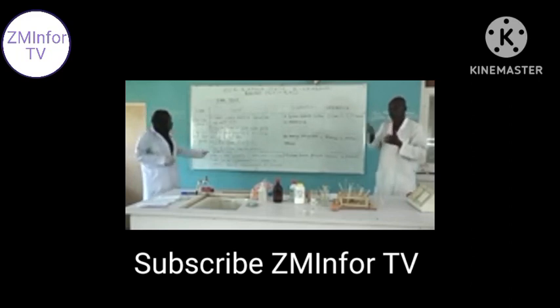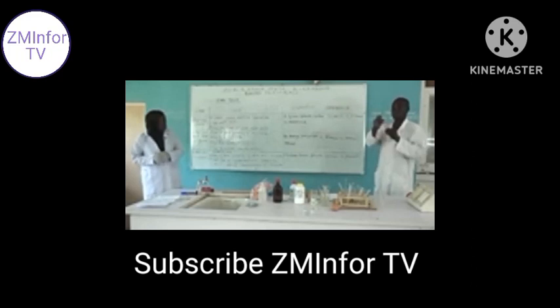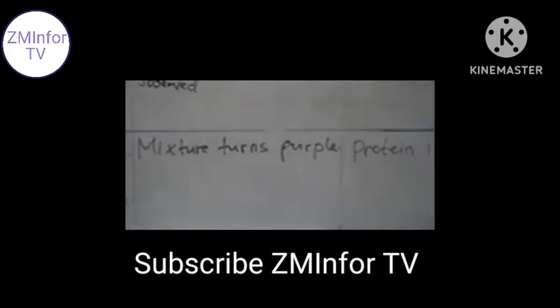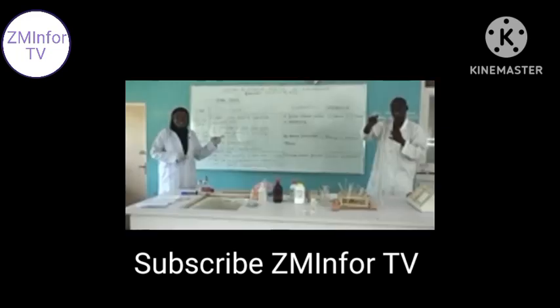We have tested for proteins. We took a small quantity of fresh milk, we added sodium hydroxide solution and copper 2 tetraoxosulfate 6 solution. We have observed the mixture turning into purple, and that purple color tells us that protein is present in the milk.